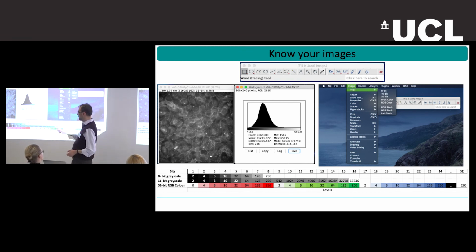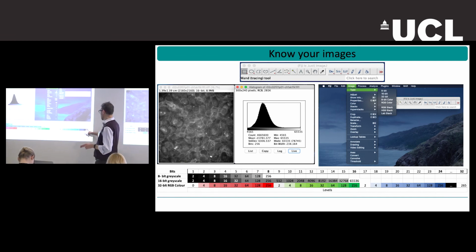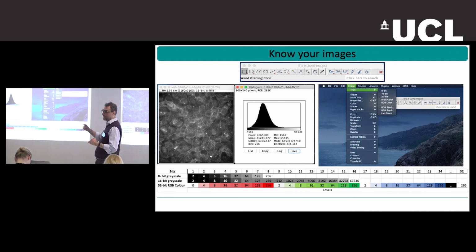The simple message is that when you have a 32-bit image, which is actually huge, you have information at this level: 256 levels for each color, and an alpha channel, from the 25th bit onwards, another 8 bits, which represents the intensity.